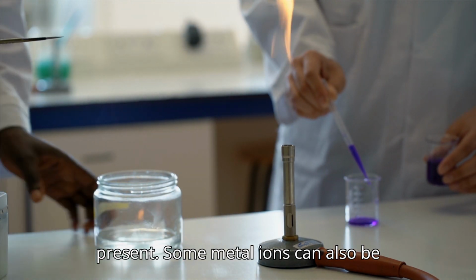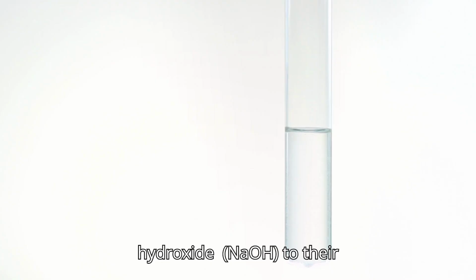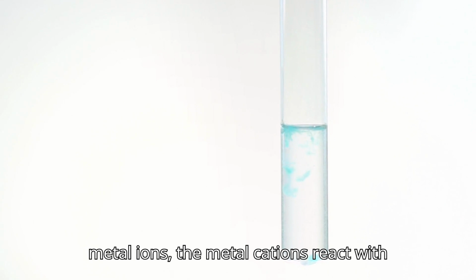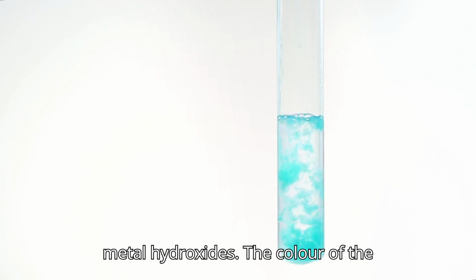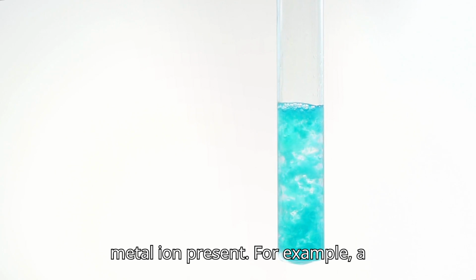Some metal ions can also be identified by adding sodium hydroxide, NaOH, to their solutions, which often results in the formation of colored precipitates. When NaOH is added to a solution containing metal ions, the metal cations react with the hydroxide ions to form insoluble metal hydroxides. The color of the precipitate that forms is specific to the metal ion present.